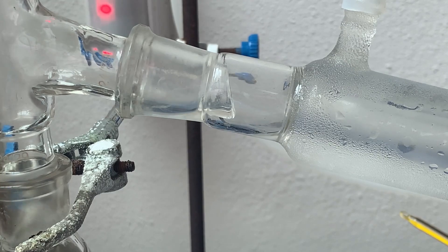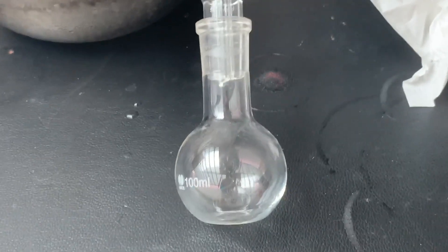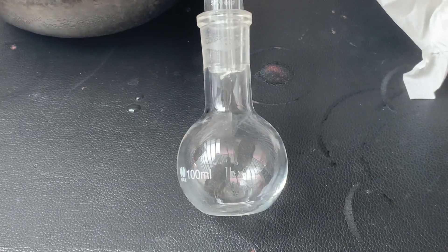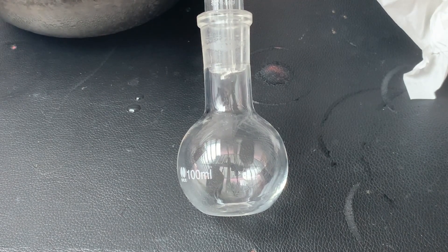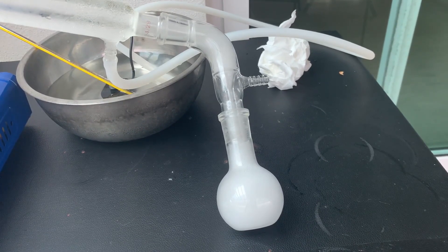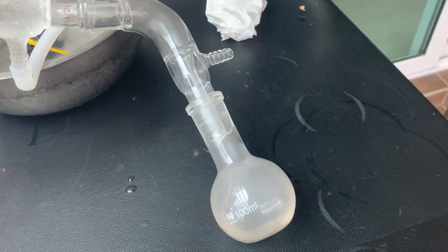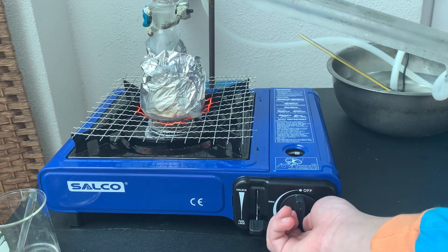After about 2 minutes of heating, I noticed the liquid condensing in the adapter. I also began to collect drops of oleum in the receiving flask. A small amount of undissolved sulfur trioxide reacted with the air to produce a fog of sulfuric acid. After collecting 30 mL of liquid in the receiving flask, I turned off the propane stove.